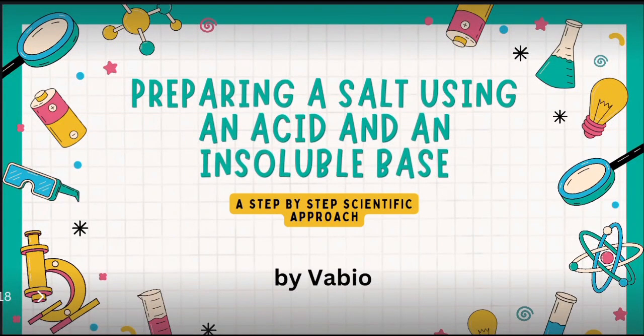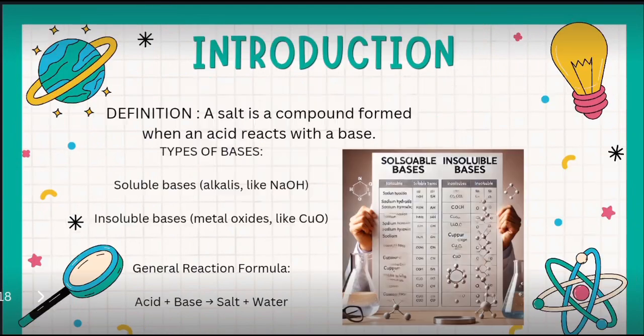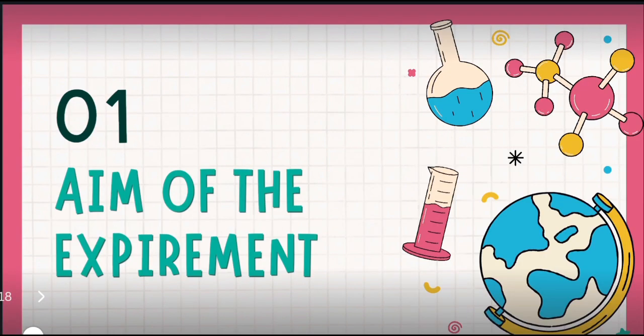Today I'm going to present about preparing a salt using an acid and an insoluble base, a step-by-step scientific approach. Introduction. Definition. A salt is a compound formed when an acid reacts with a base. Types of bases: soluble bases and insoluble bases. General reaction formula: acid plus base equals salt plus water.